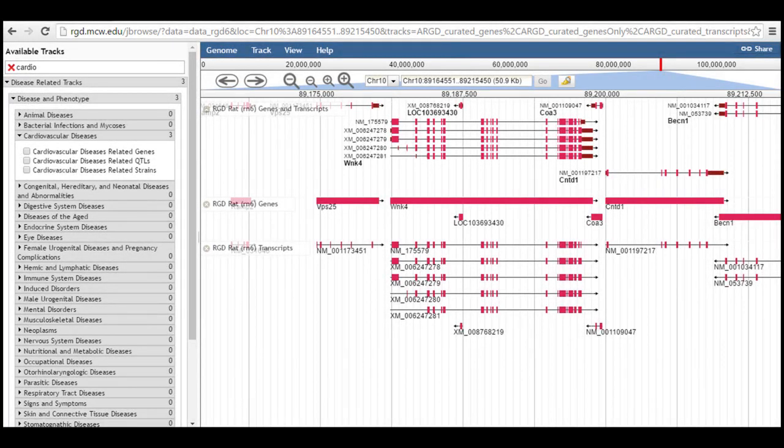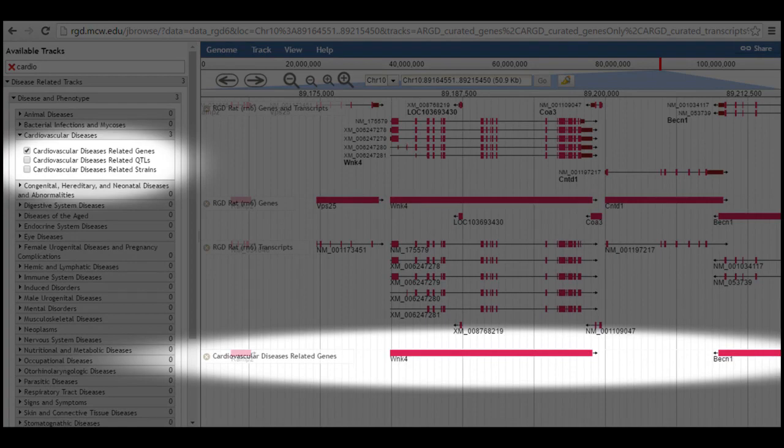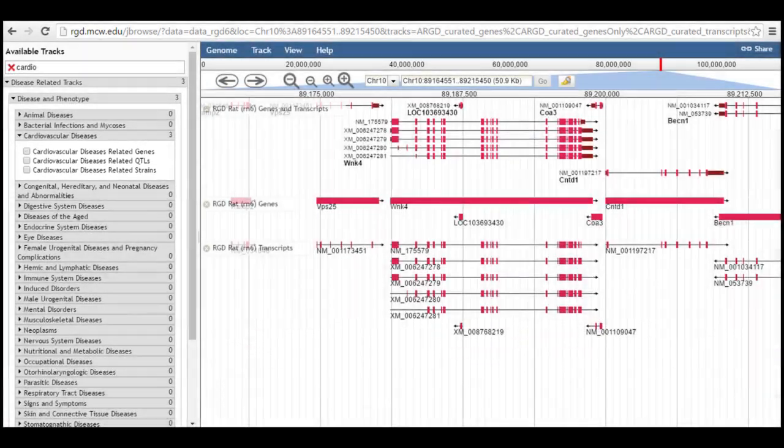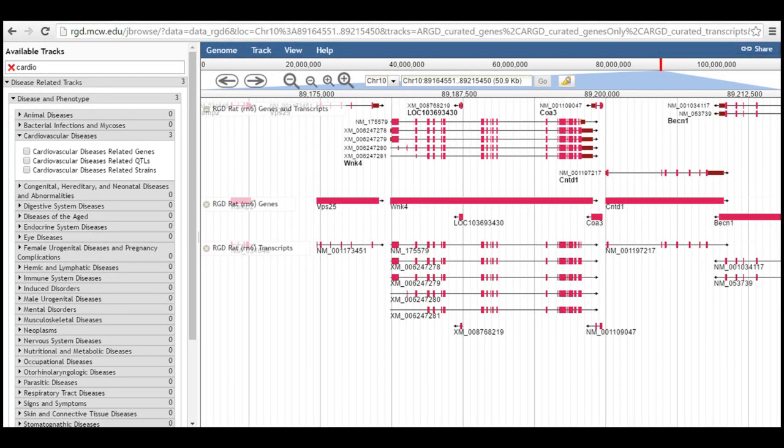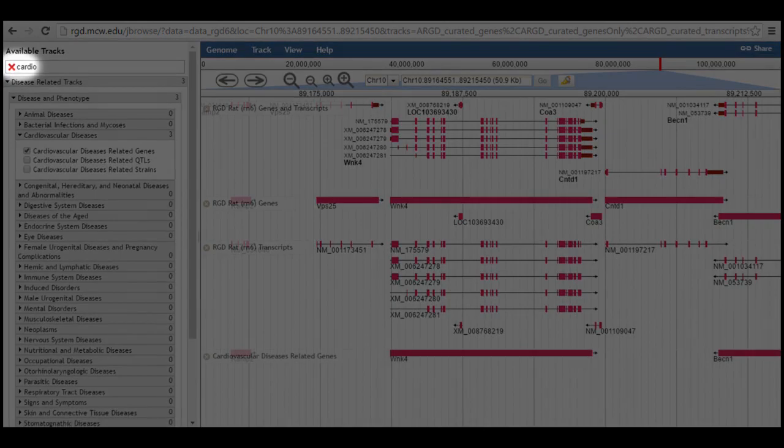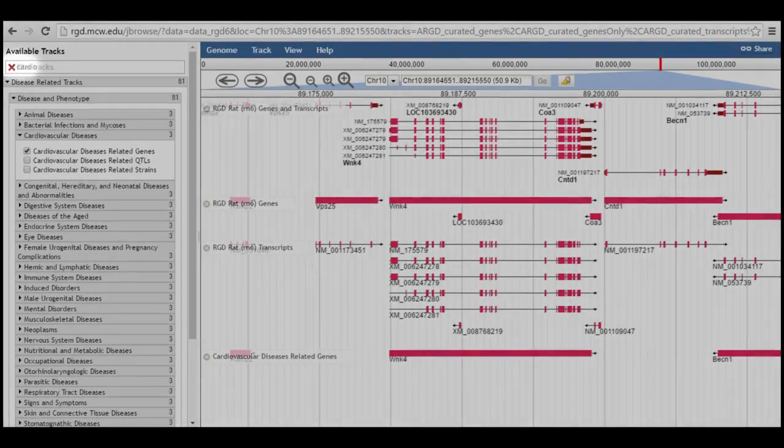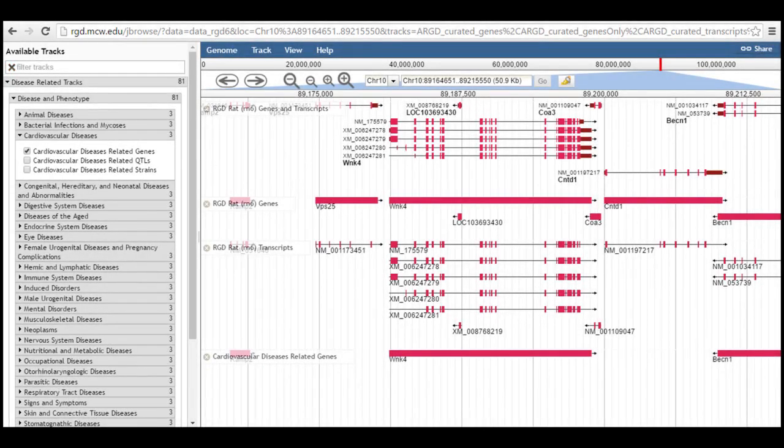Checking a box beside a track name turns that track on, placing it at the bottom of the display to the right. Unchecking it turns the track off. Click the red X in the filter box to restore the full list of available tracks. If you selected one or more of the tracks in the filtered view, the selection remains when the full view is restored.